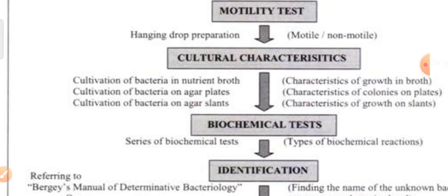After performing motility, go for cultural characteristics. Find out the cultural characteristics of the organism by inoculating it on selective media. You can cultivate on nutrient agar, nutrient broth, or any kind of specific media. Depending upon your gram staining and motility results, you can select a medium for cultural characteristics.